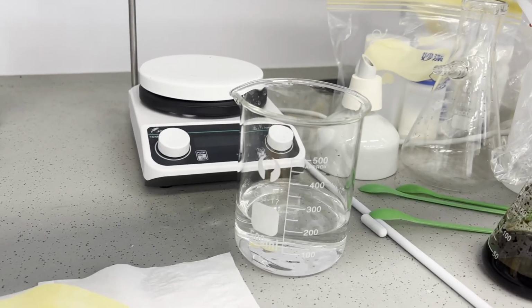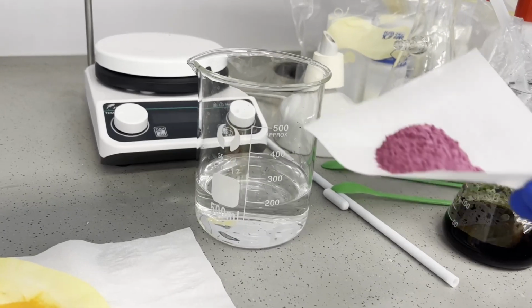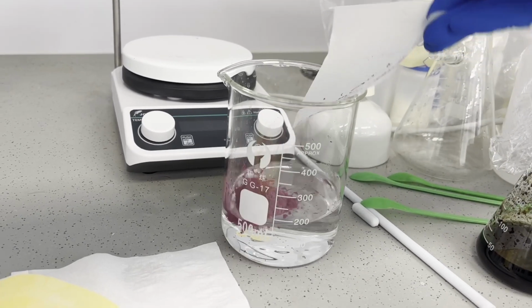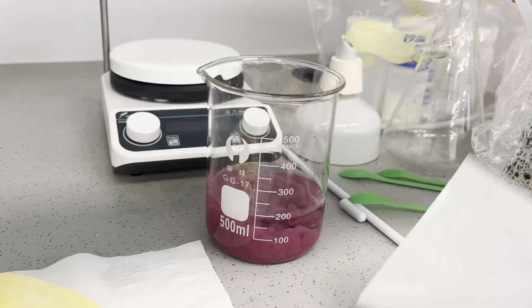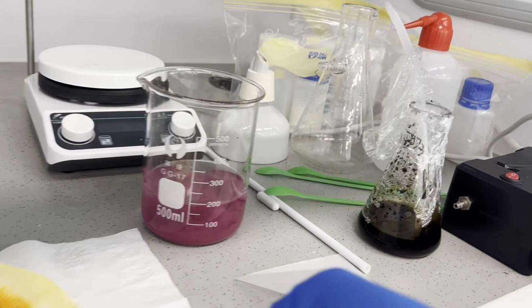The final 2 complexes I'm making are nitrito and nitro. They are the first observed case of linkage isomerism. The only difference between the two is whether the oxygen or the nitrogen in the nitrite group is binding to the cobalt. Their synthesis is also nearly identical.